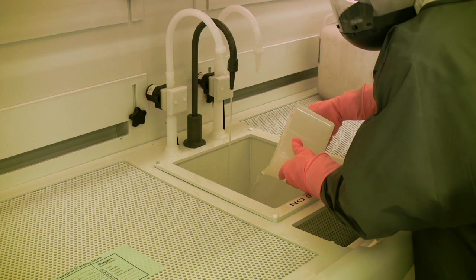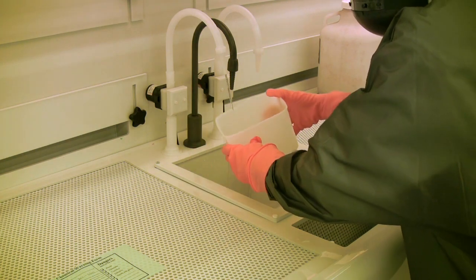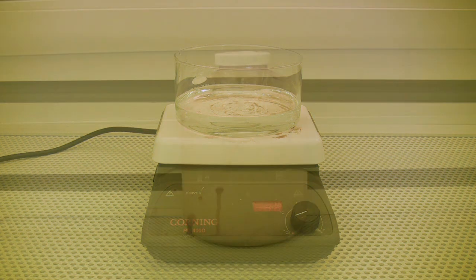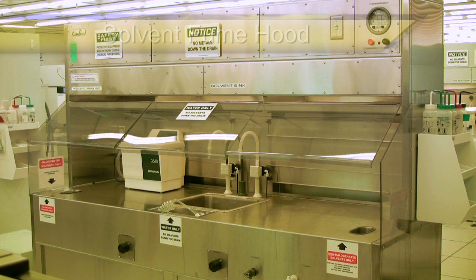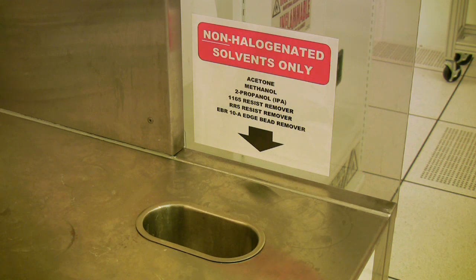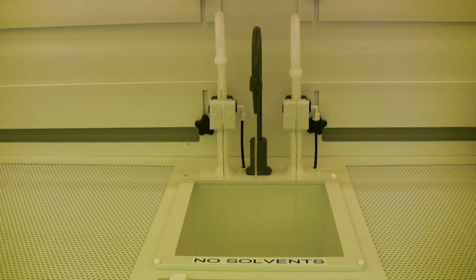When disposing of waste chemicals, it is extremely important that you adhere to all the rules implemented by the cleanroom staff. When disposing of acids or bases, you may pour them down the sink drain with the water running, allowing the water to run for several minutes to flush as much of the chemical out as possible. If the chemicals have been heated, you must let them cool to room temperature before pouring them down the drain. When disposing of solvents, they must be poured into the solvent waste carboys in the fume hood. In the Marcus cleanroom, there is a dedicated solvent fume hood equipped with two drains: one for halogenated solvents such as trichloroethylene and chloroform, and the other for non-halogenated solvents such as acetone, isopropanol, and methanol. Acids and bases are never to be used in the solvent fume hood or poured into the solvent waste carboys, and solvents are never to be poured down the sinks, no matter which fume hood you are using.